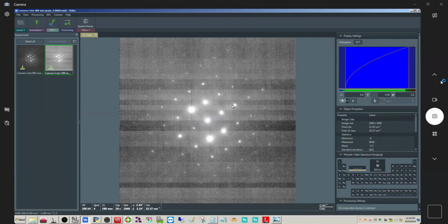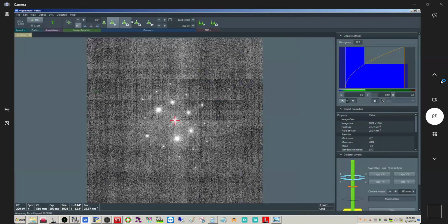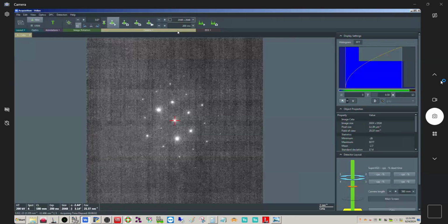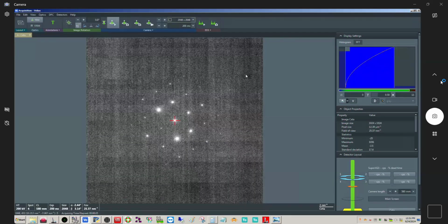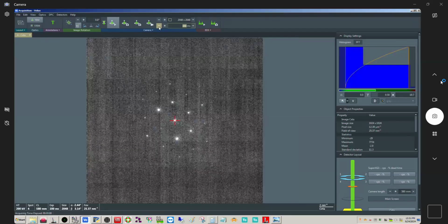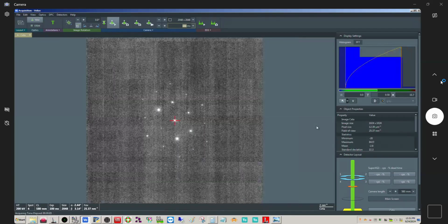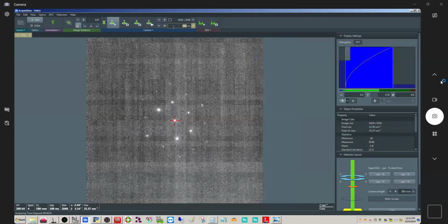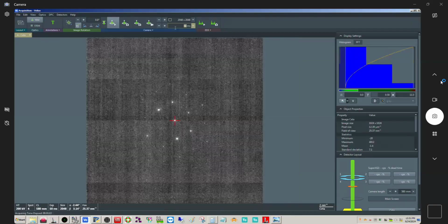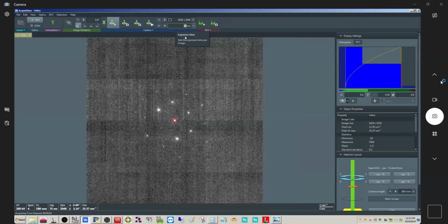Yeah, so this is still pretty high, even with the frame combining. So what's going on here? If I increase this, for some reason, when I increase the binning, it's giving me a high number. So let me drop this down. Okay, that's a little better, but it's still giving me a high number. If I go to 50 milliseconds, that's safer. Okay, all right, 75 milliseconds.